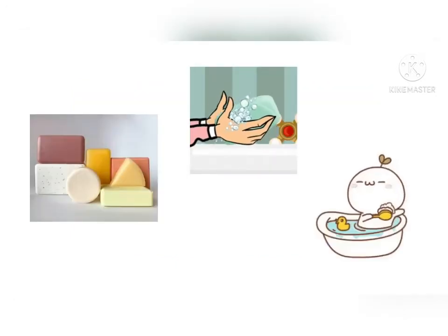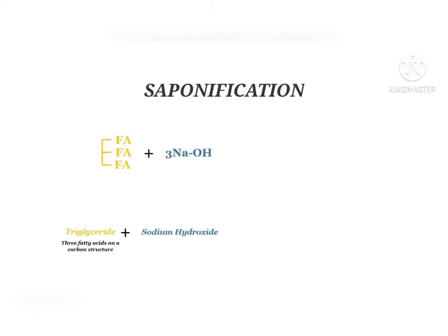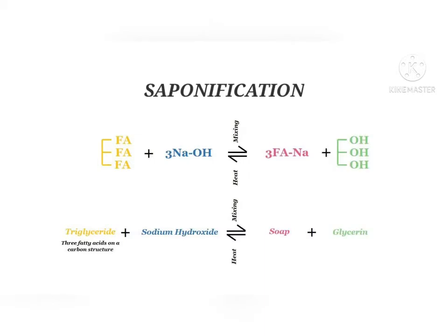Soaps are made from fats, oils, or fatty acids, which have cleansing properties in water. The common process of making soap is saponification, in which triglycerides present in fats and oils react with alkalis, such as sodium hydroxide or potassium hydroxide, in order to form soap and glycerol.